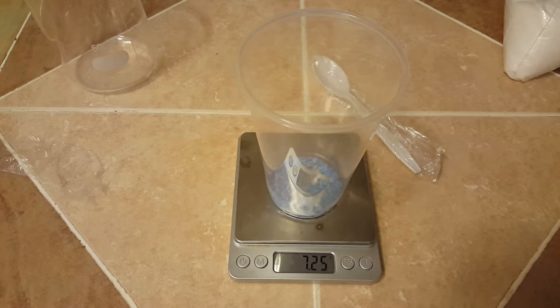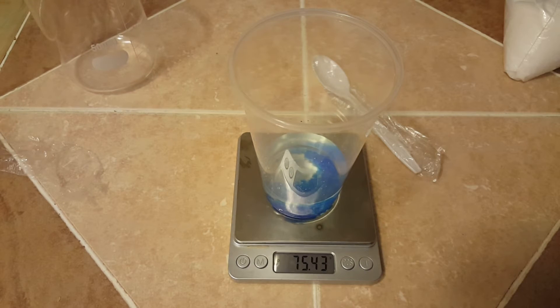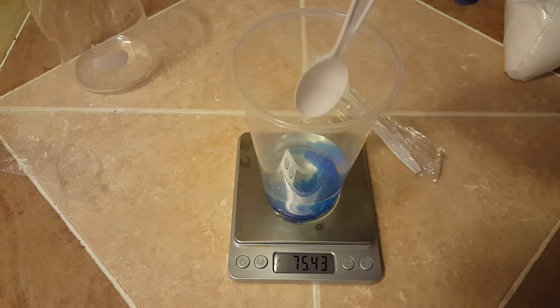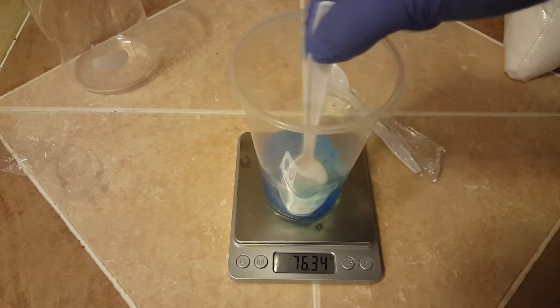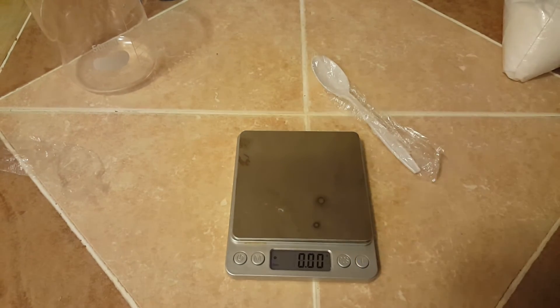You want to make your copper sulfate solution first. To do this it's going to take about 7.25 grams of copper sulfate and 75.43 grams of water. The reason you want to make your copper sulfate solution first is copper sulfate takes quite a long time to dissolve.